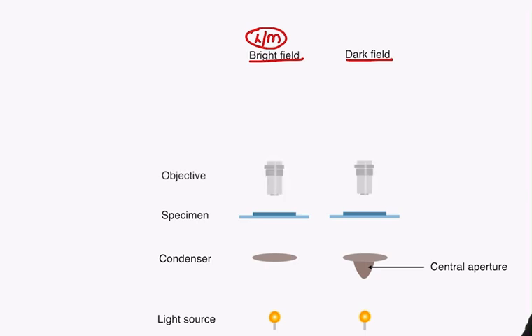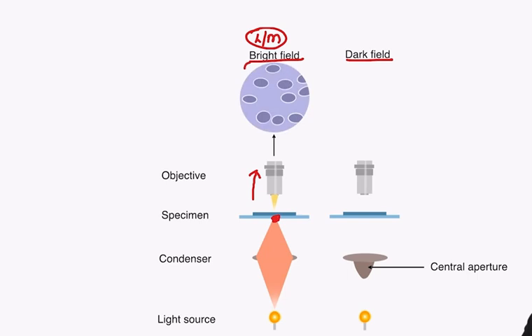And then the light is going to go to the lens system, of course, first to the objective lens. So overall, everything looked the same. Giving you a quick recap, what happens in a light microscope is that the light is going to hit the object, that is the specimen. After that, the same light will now travel through this entire objective and eyepiece lens system, and the final photo that you get has a lot of light. It's very bright. You can see the organism getting highlighted. That is why it's a light microscope.